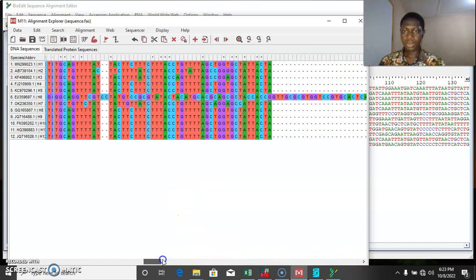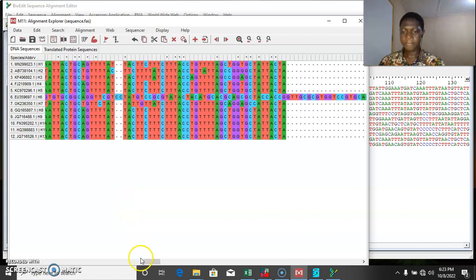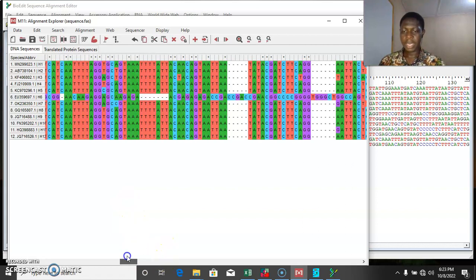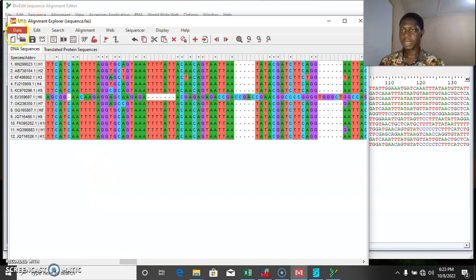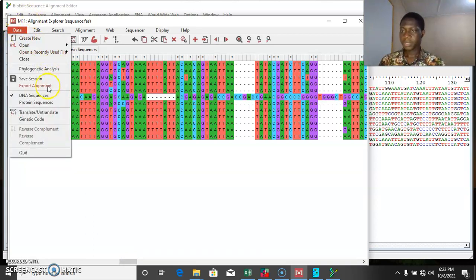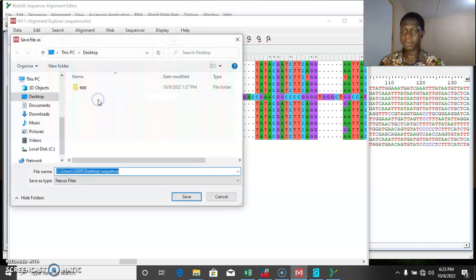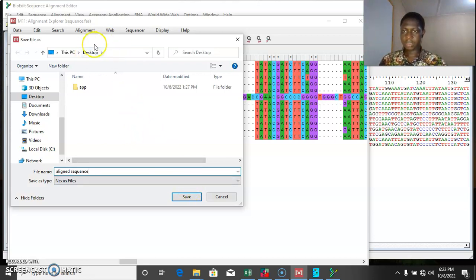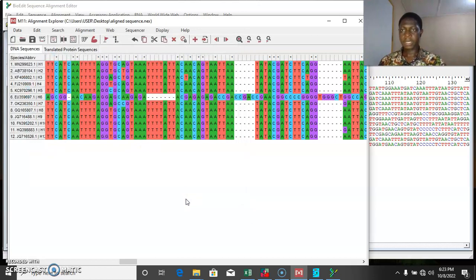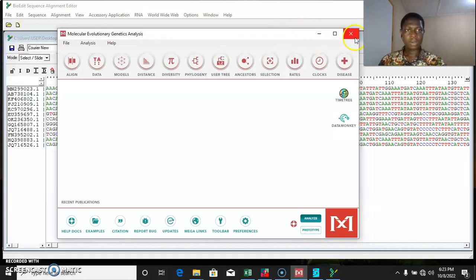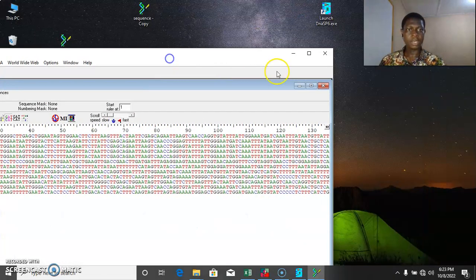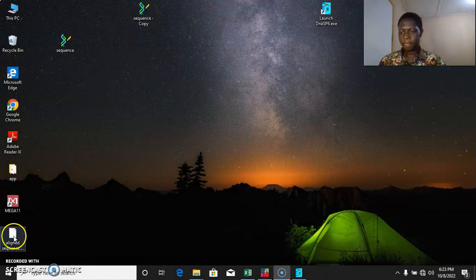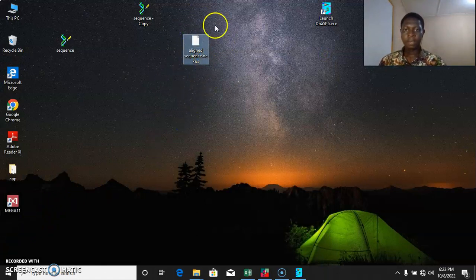So once our sequences have been aligned, the next thing we want to do is to export this aligned sequence. We come to the Data option, then export data — we export data as Nexus format. So we can save this data as 'aligned sequence'. We are saving it on the desktop. Save. So once you're done with that, you can close the MEGA software and also the BioEdit. So this is our data — let's save 'aligned sequence'.